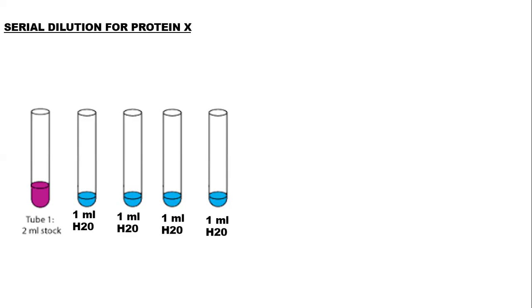If the stock is not much, for instance if it is 2 mL that is given to you, you don't use the 2 mL directly. You can use 1 mL. But if it is many, like 10 mL, you can decide to use 2 mL or 3 mL. However many mL you use, if you use 3 mL, you should know that the amount of water you are going to use is also going to be 3 mL. Okay, so here we are going to go by 1 mL.